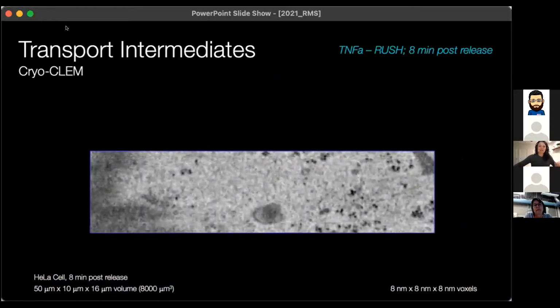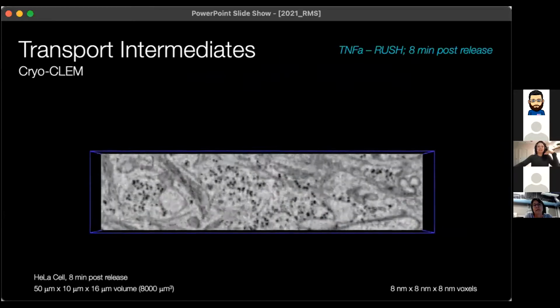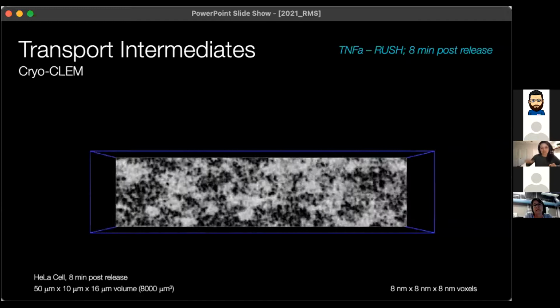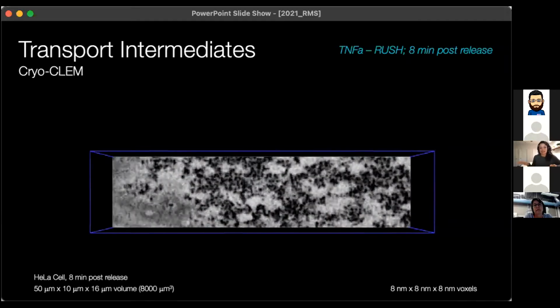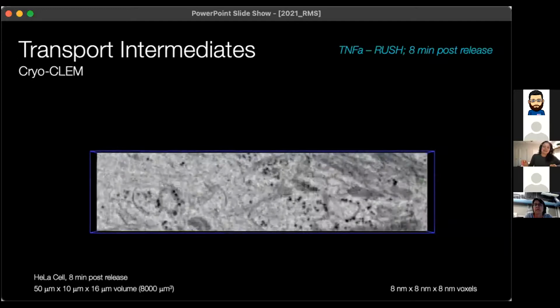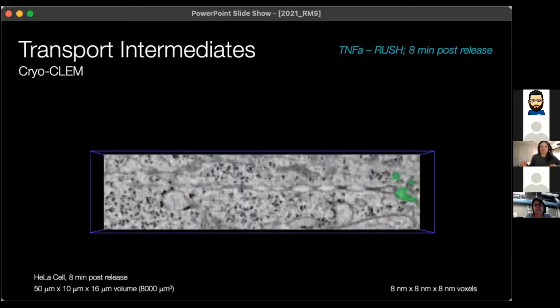All right, so as this scrolls through, we're starting at the top. So we'll go through the plasma membrane. You can see all the cortical actin there. You can see some of the ER membranes, the polyribosomes on the nuclear envelope, the pores, and now we're down into the nucleus. You can see the chromatin. You might have noticed on the right that there is an exit site right there, highlighted in green. And if we turn on our cargo fluorescence, you can see that the cargo fills up that exit site.